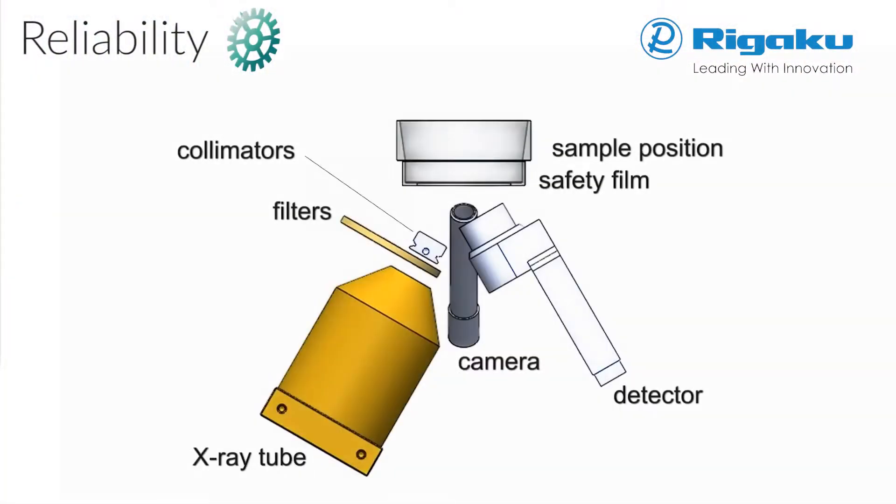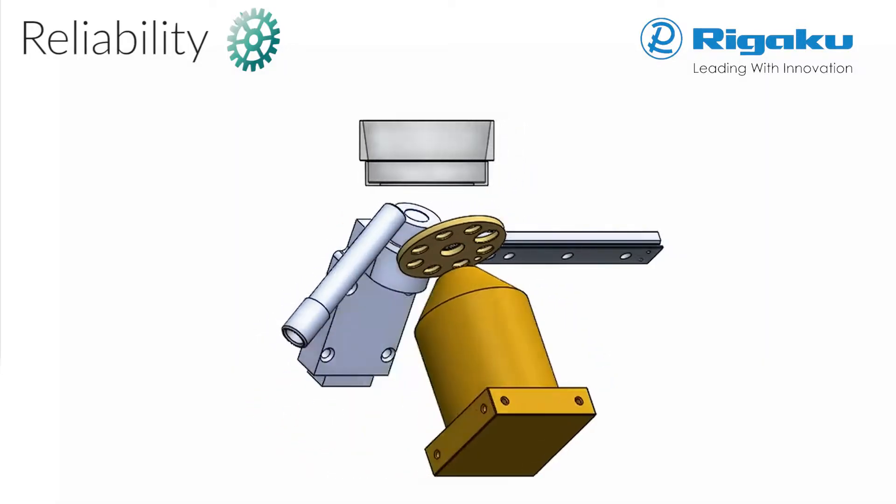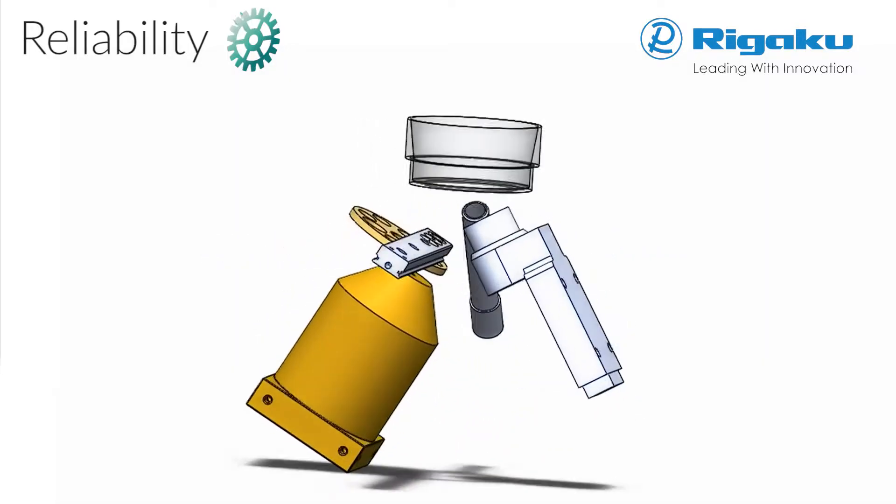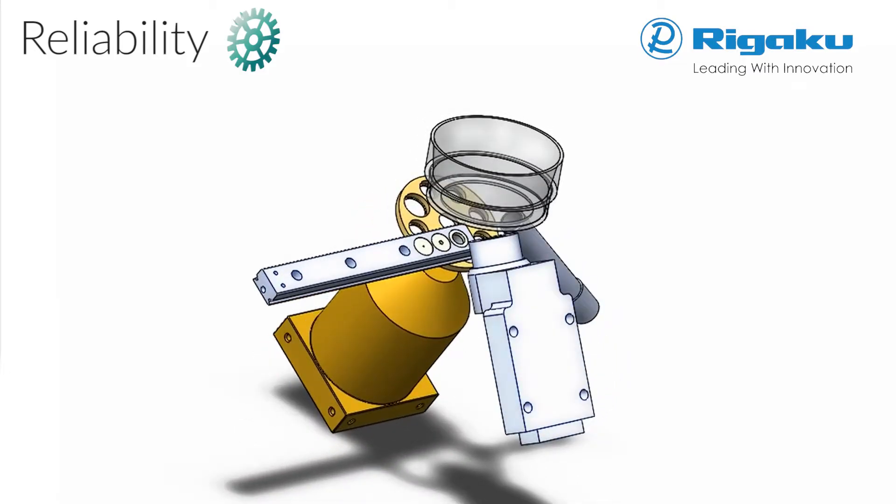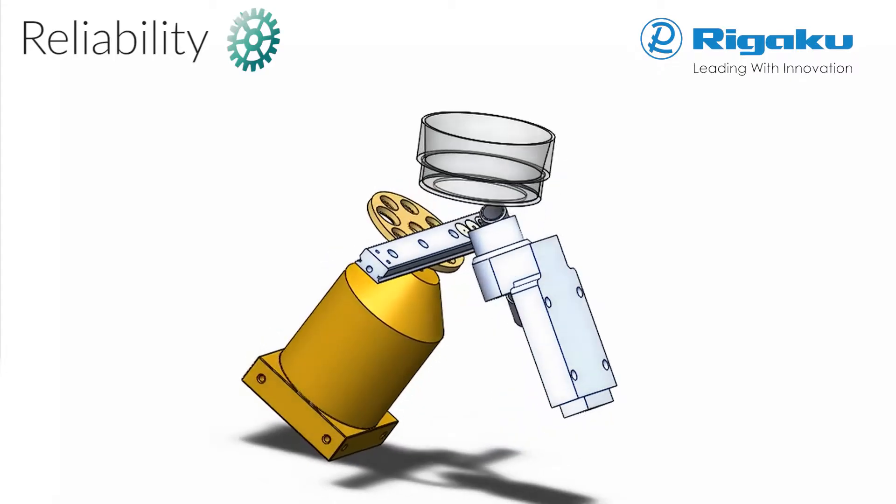Rigaku XRF spectrometers are the most reliable in the world. Engineered for X-ray tube conservation, the selectable collimated optics are protected by safety film, requiring no tools to change.